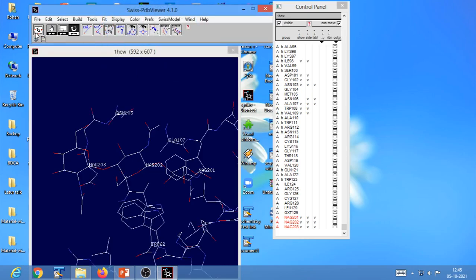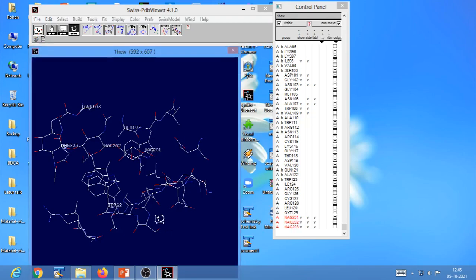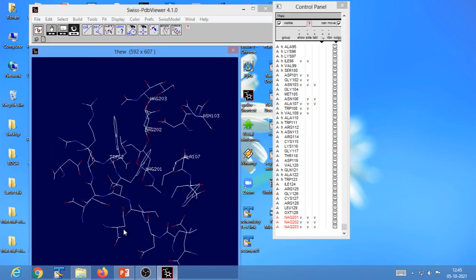After doing this, you can see that you have added to the display all the groups that have at least one atom within 6 angstrom of any atom in your TRINAG inhibitor. So this is another trick of selecting how many residues are surrounding any particular residues.